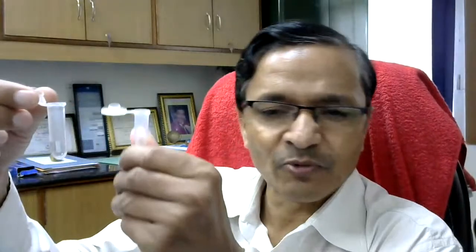So you can see one tube like this. You can see the bottom. This is pointed or conical bottom. So 1.5 ml Eppendorf tube. Of course, 0.5 ml tubes are there, smaller in size. And then you can also see that there is 2 ml Eppendorf tube, 1.5 ml and 2 ml. Difference is the bottom you can see here. This is something conical and this is in the bottom if you see, this is round bottom.